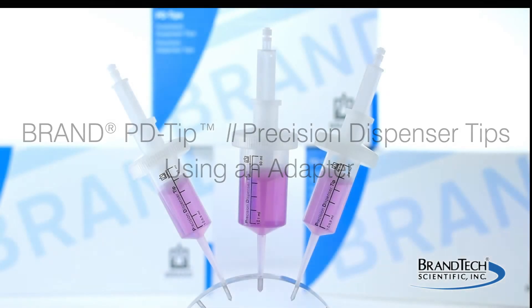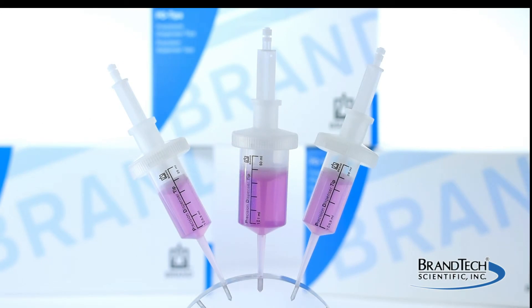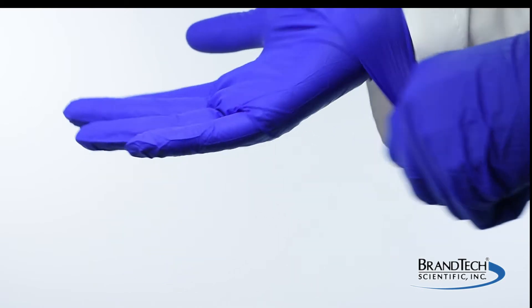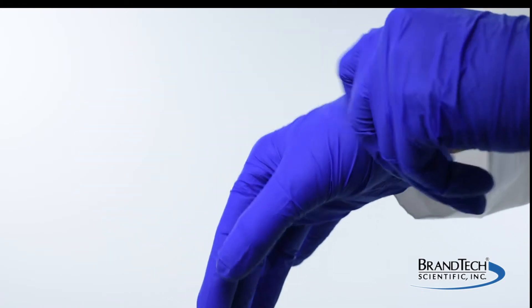This video demonstrates how to use adapters for large volume bond PD tips. When working with your pipette, wear all the appropriate personal protective equipment and observe all safety precautions.